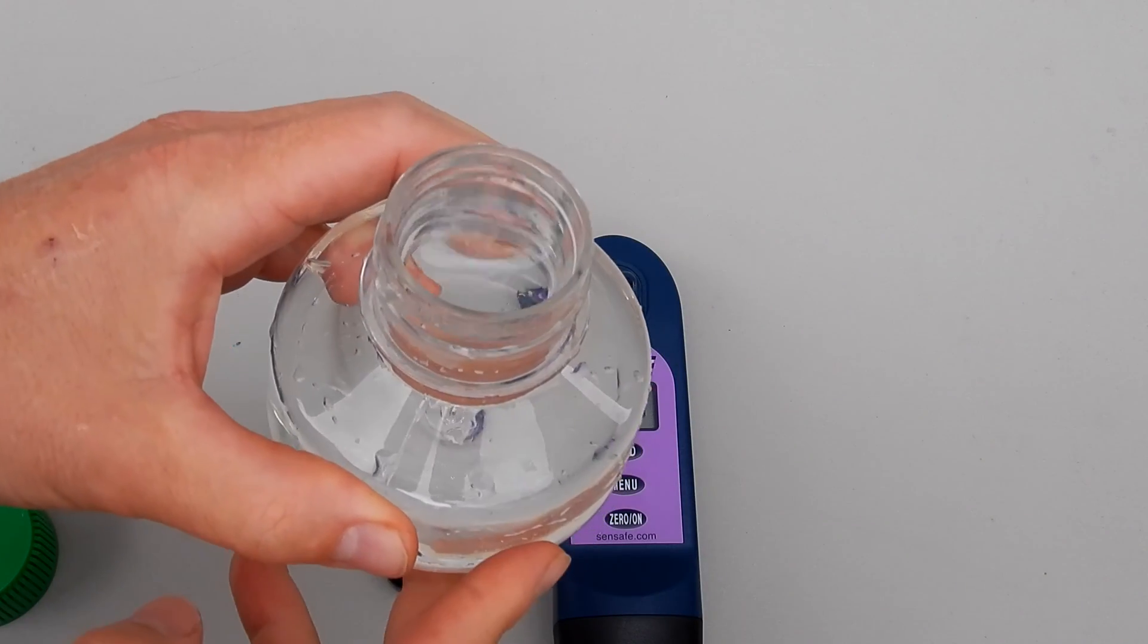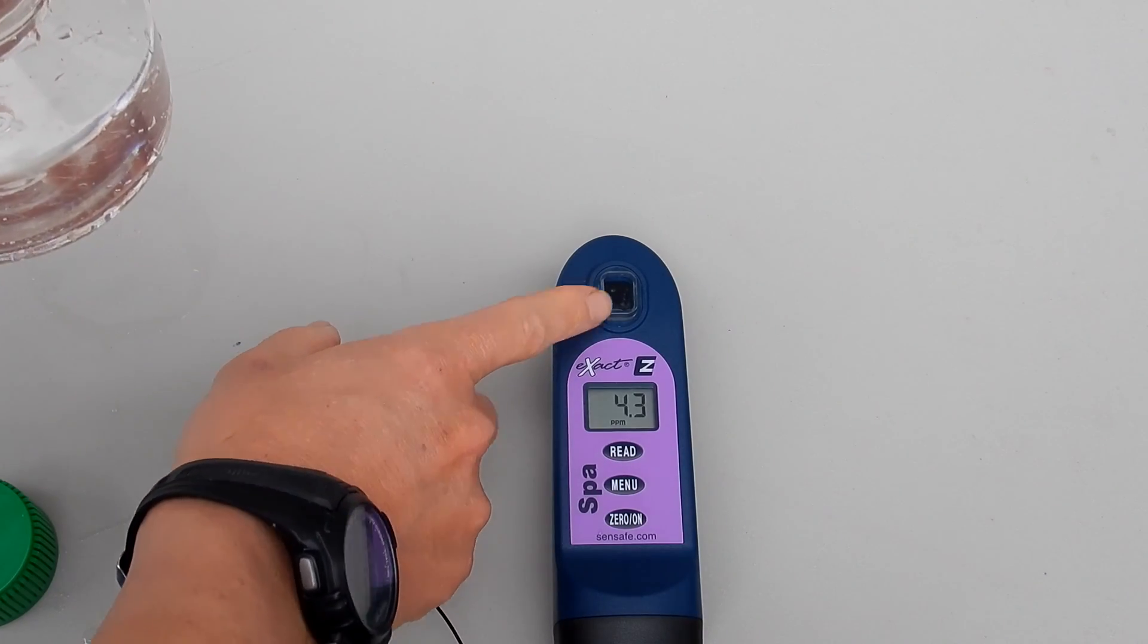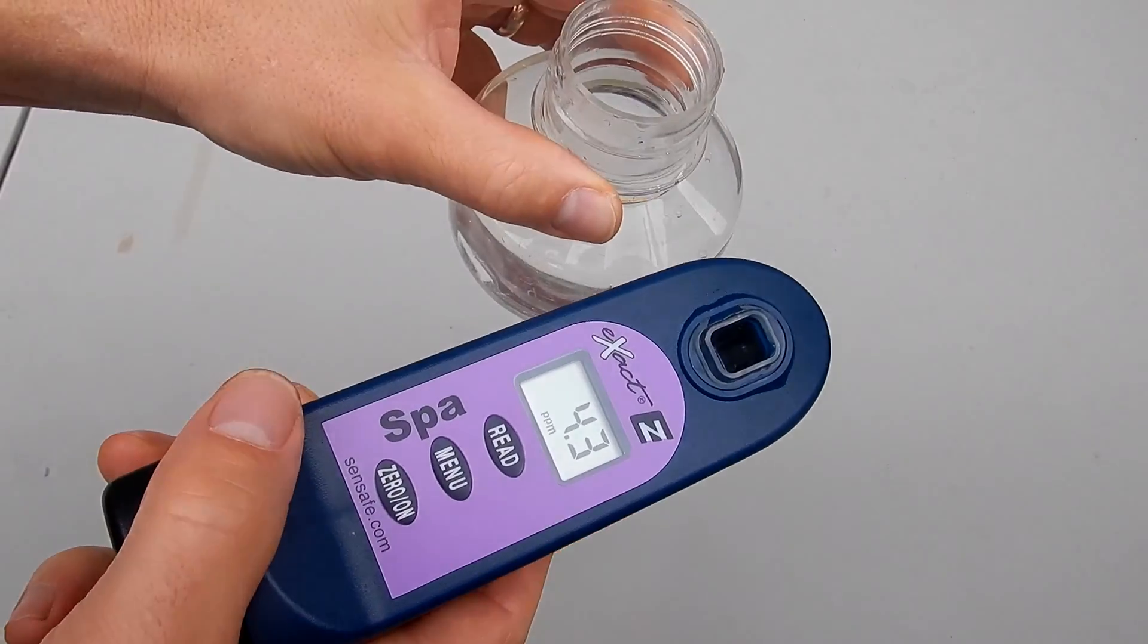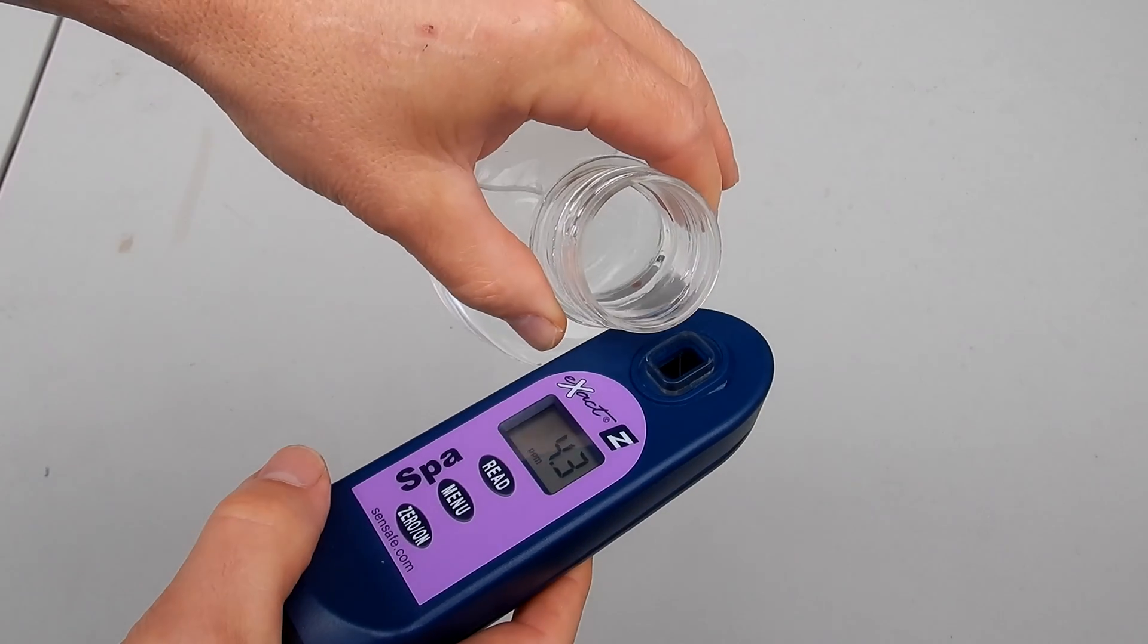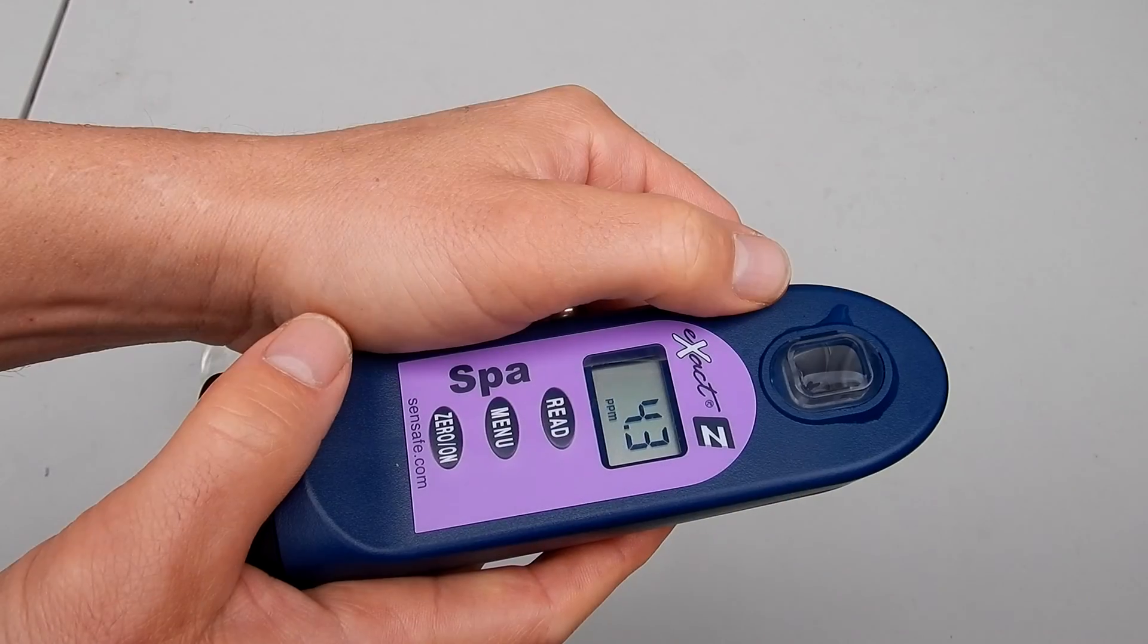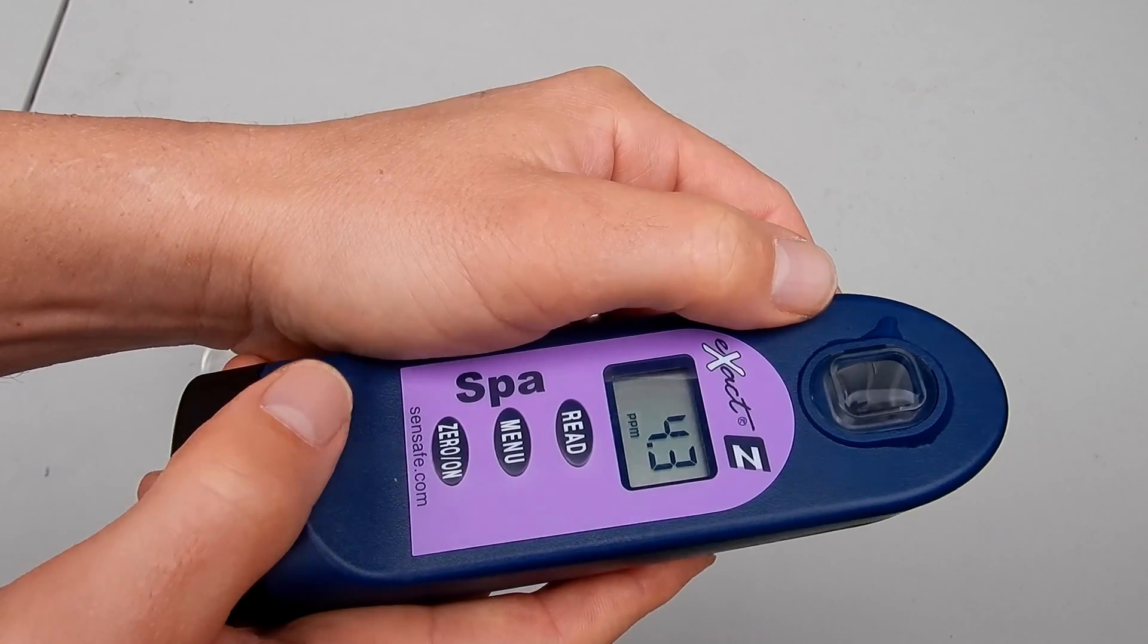To do the testing you just take your water sample and you'll fill the chamber to the top of the chamber. Also note that this tester is waterproof. For accurate testing results you want to make sure you fill the chamber to the top.